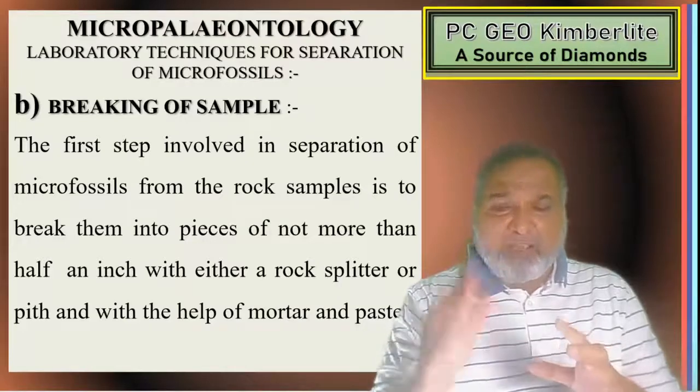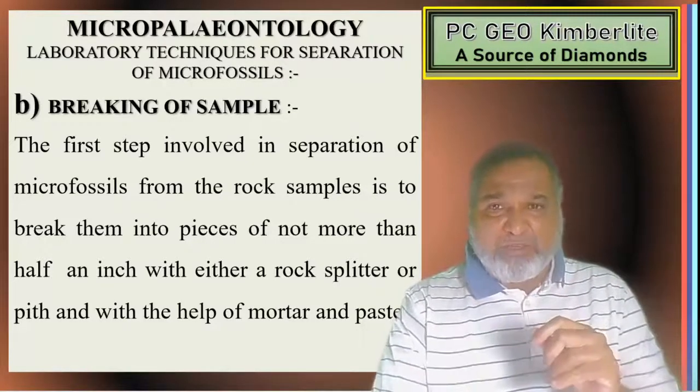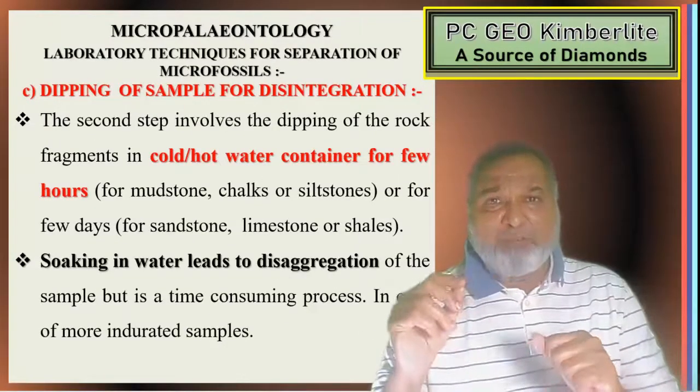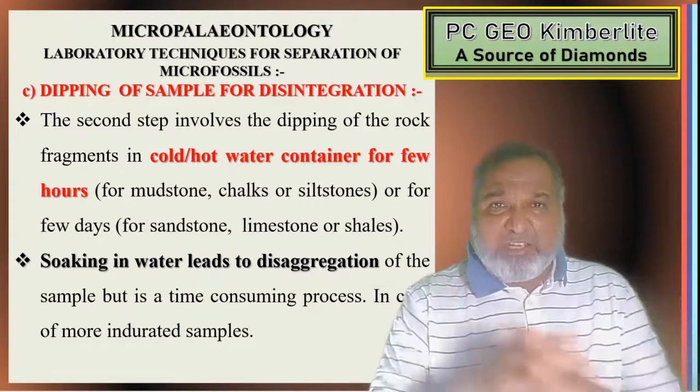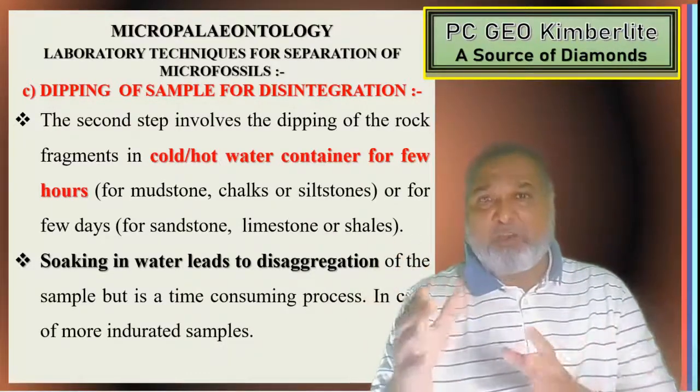So we have to break down the rock sample into half-inch pieces. The second step involves the disintegration, that is, dipping the rock fragments in cold or hot water.